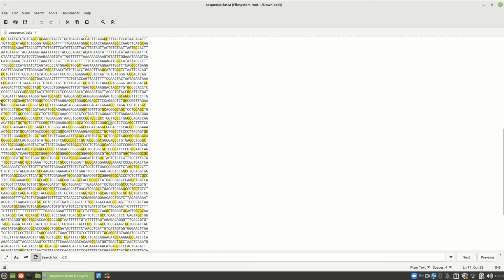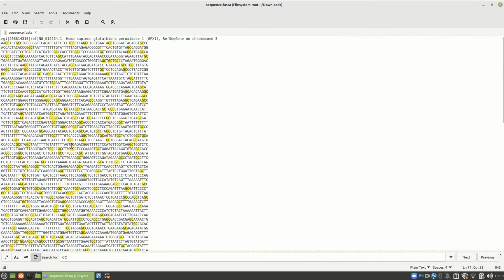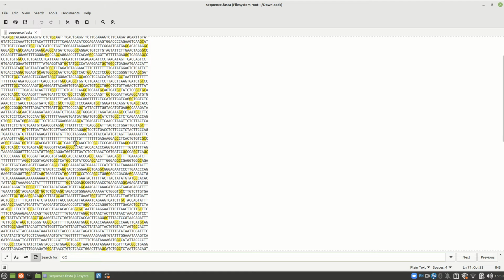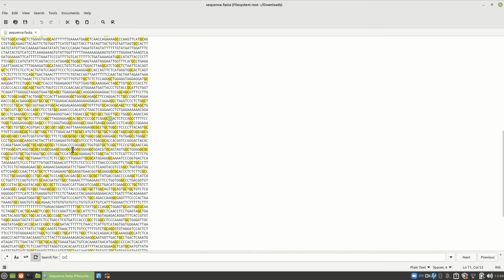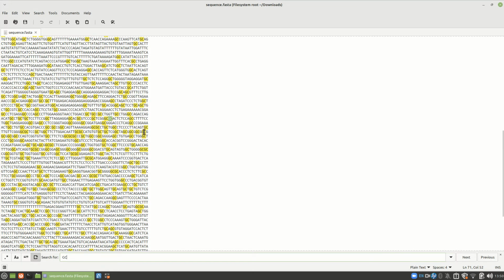you still can detect the sequence here, all right, with G's and C's. So there are way more in this region than there are in the others, but it's not as good. And one reason for this may be that we're going in the opposite direction of this sequence, but no, it's forward. But here is your CpG island, definitely in this region. See how many G's and C's. Now, I found that it's better to search in humans.